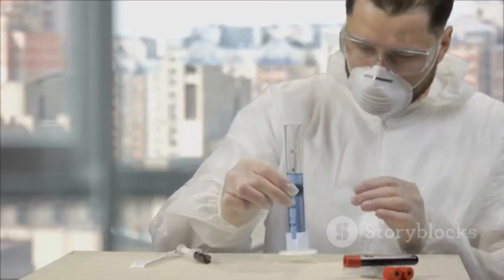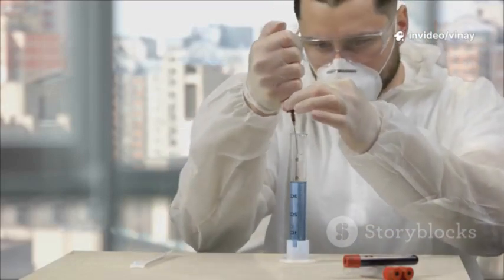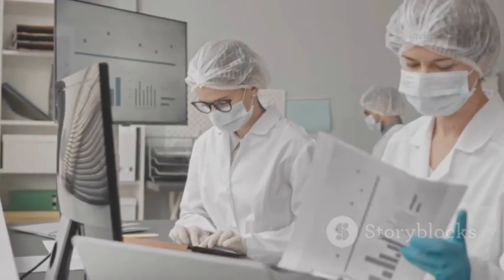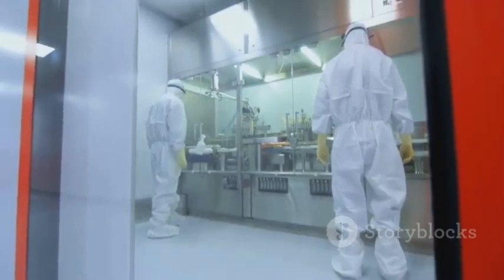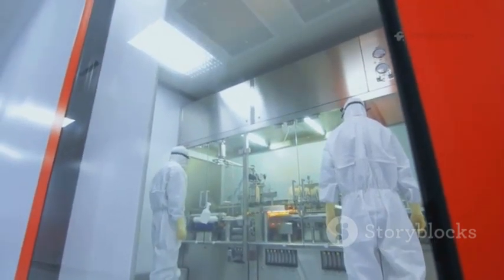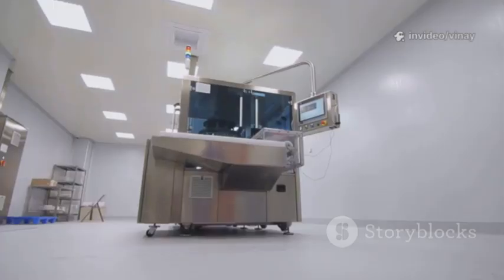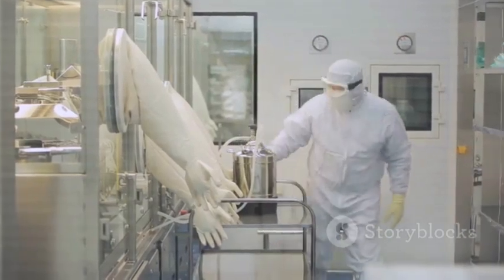It's the foundational technique that underpins much of the innovation in biotechnology, ensuring that the most advanced therapies are not only potent, but also pure and safe for administration directly into the human body. Think of it as a highly choreographed performance where every element plays a vital role. The air must be pure, the surfaces must be sterile, the equipment must be flawlessly prepared, and the personnel must move with deliberate, trained precision.